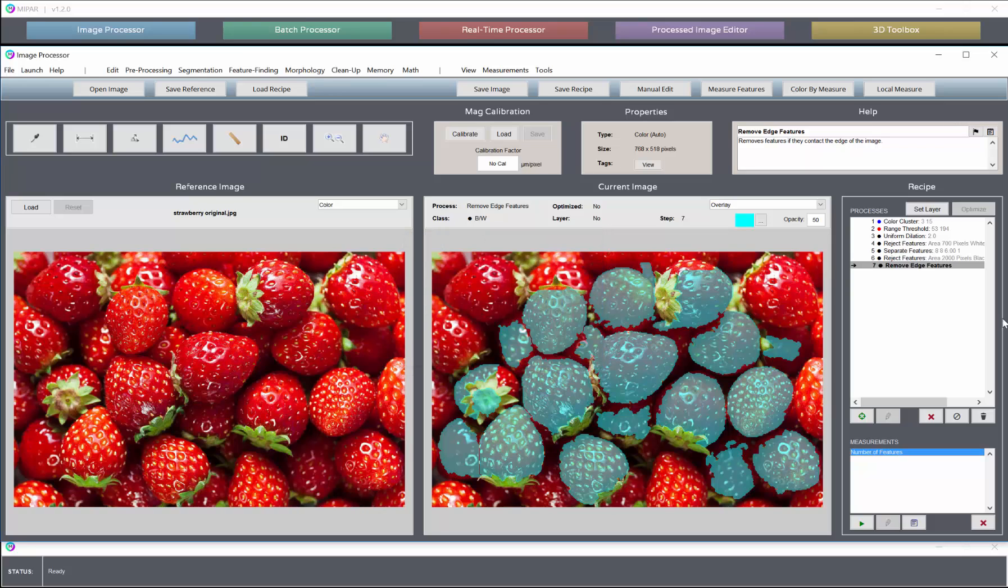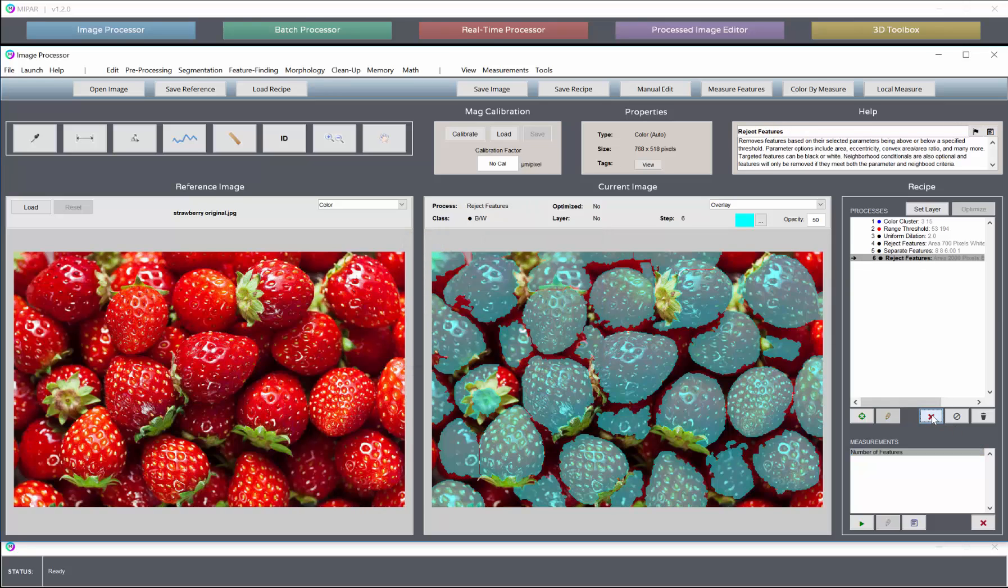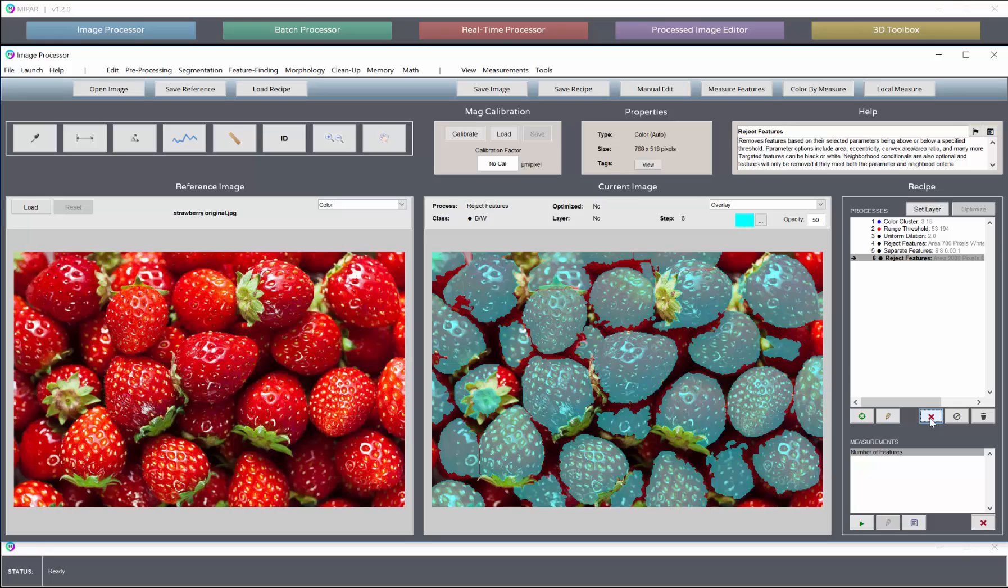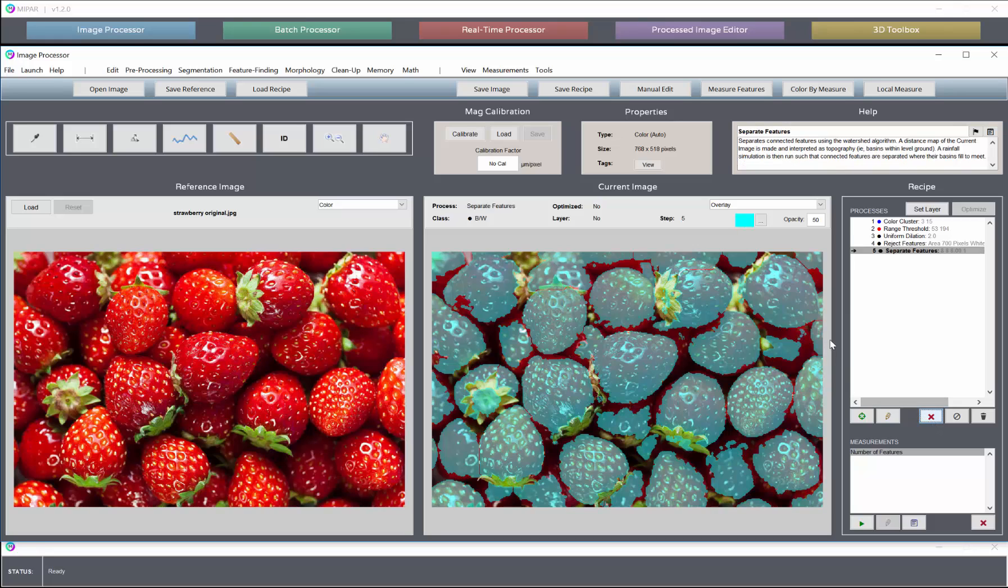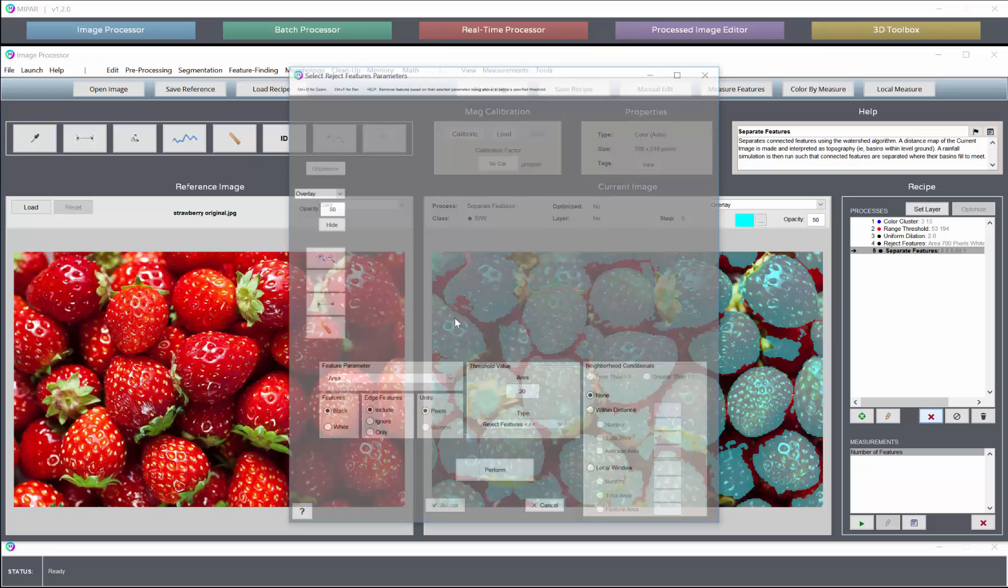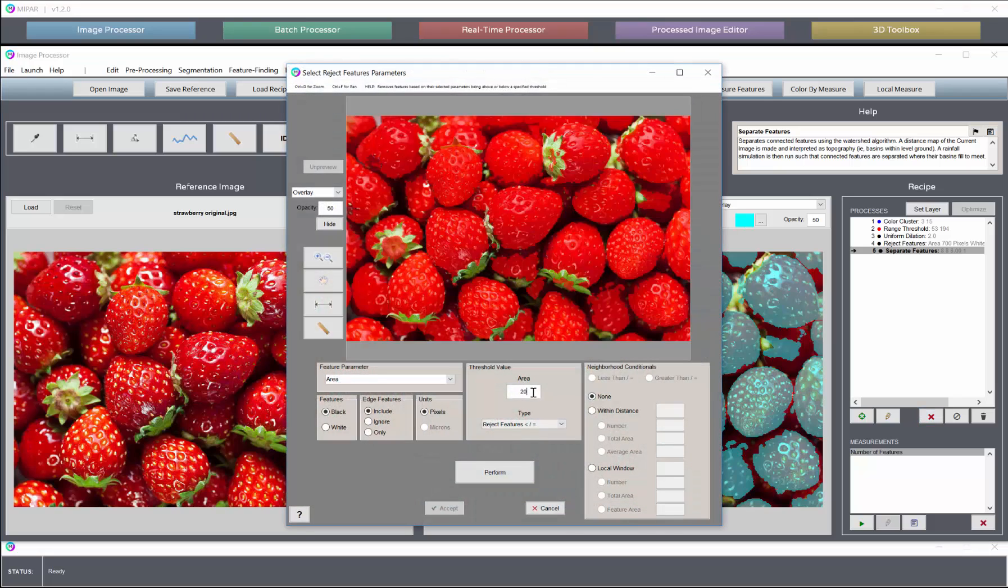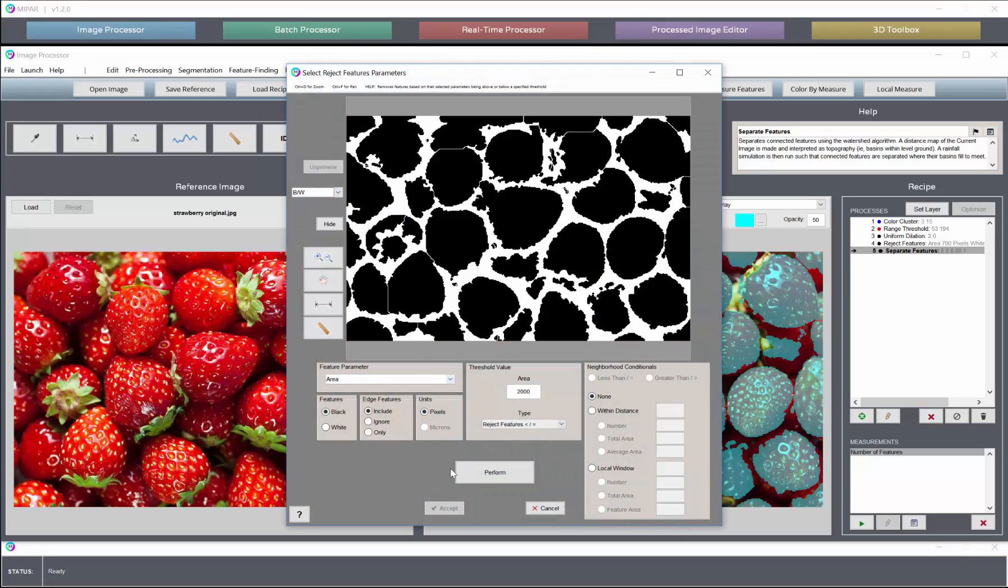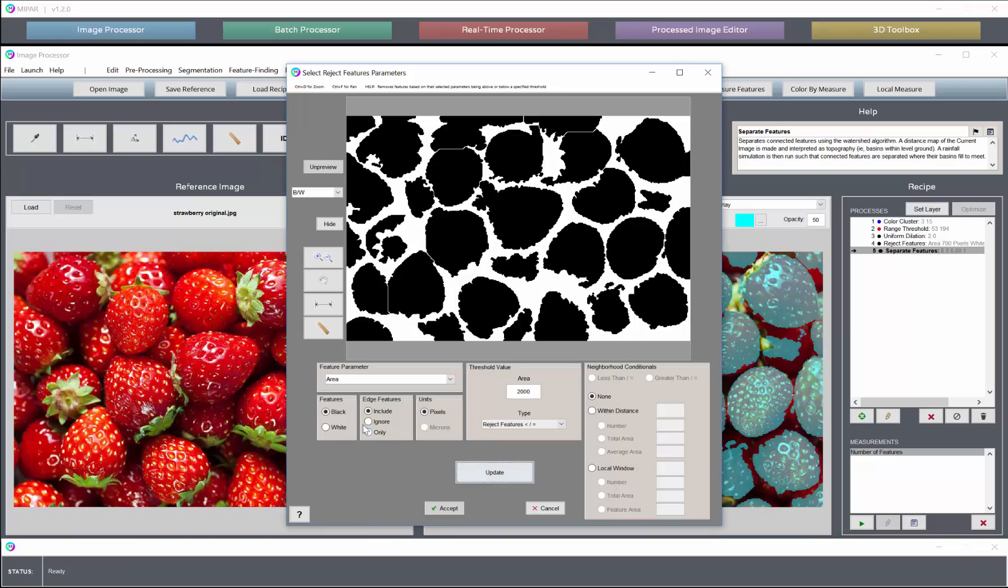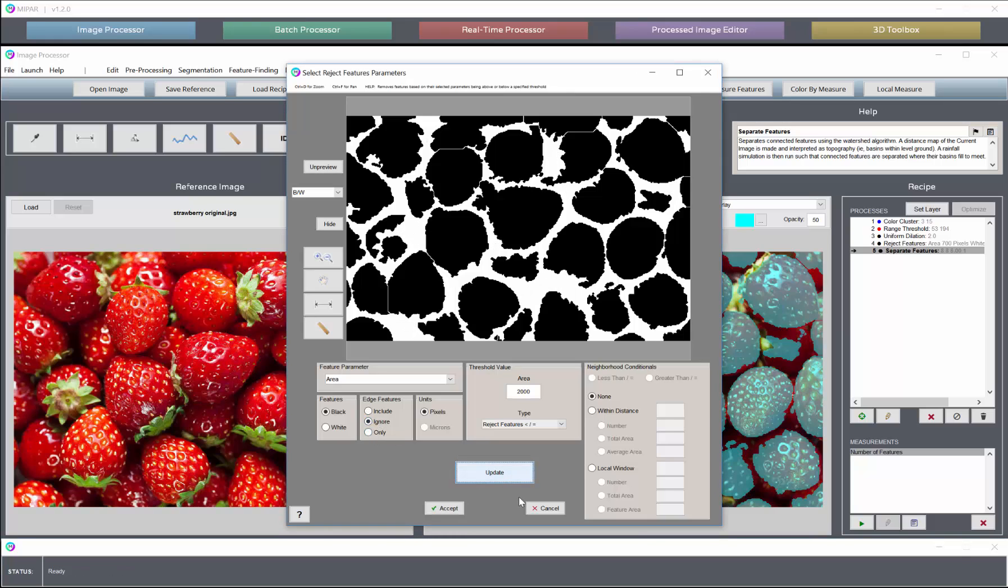We may want to get a bit more clever and not exclude any edge features at all. Just exclude the ones that are under 2,000, but ignore edge features. And that will keep the edge ones intact.